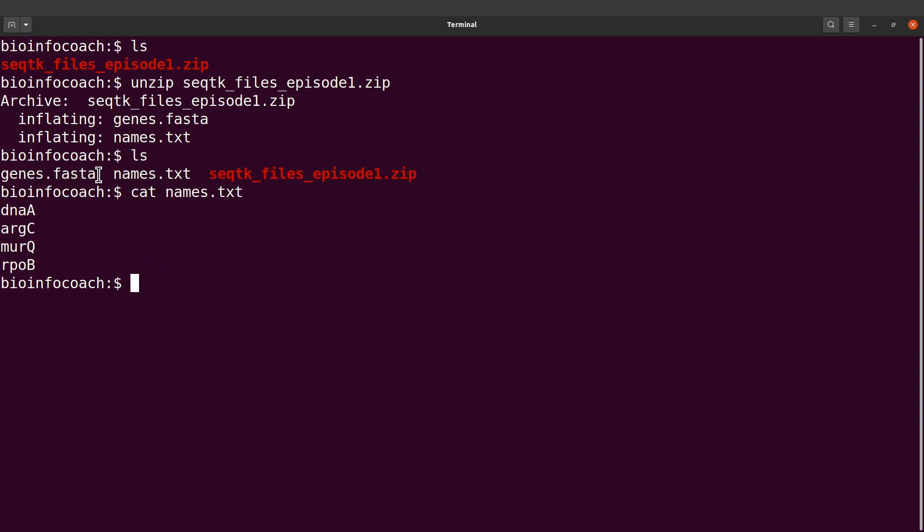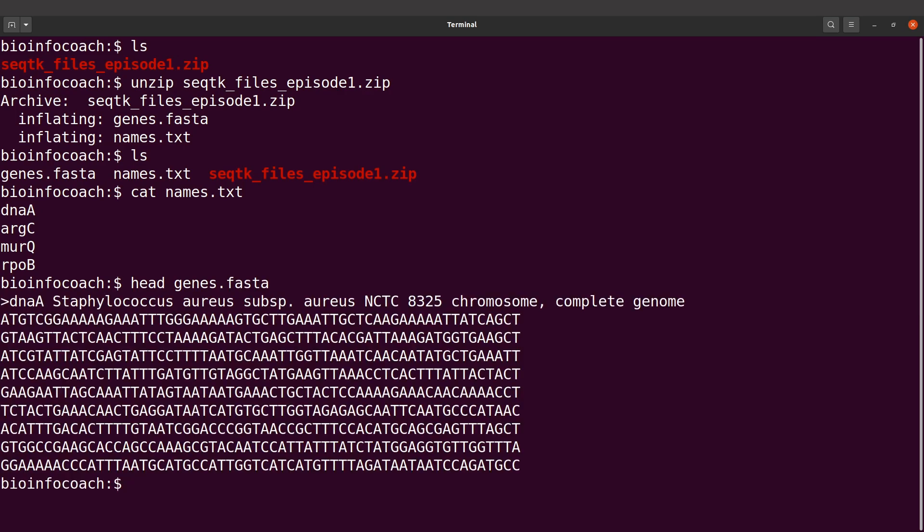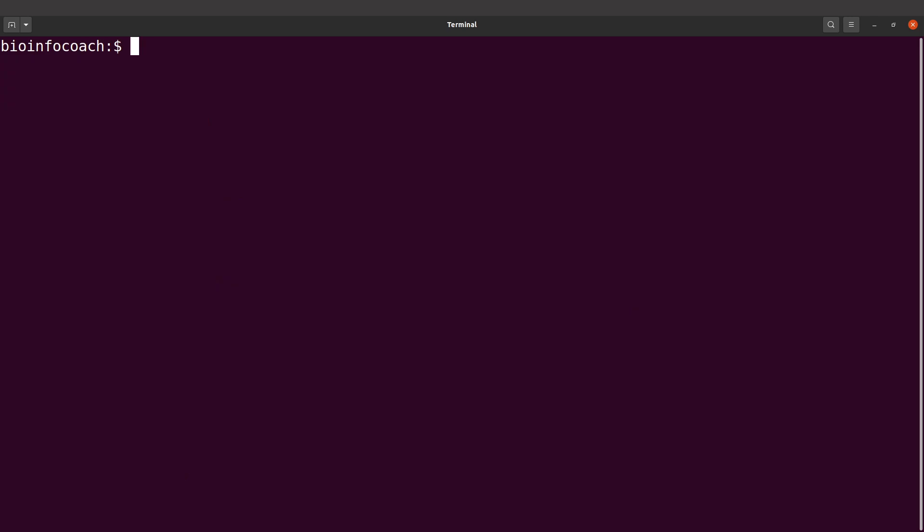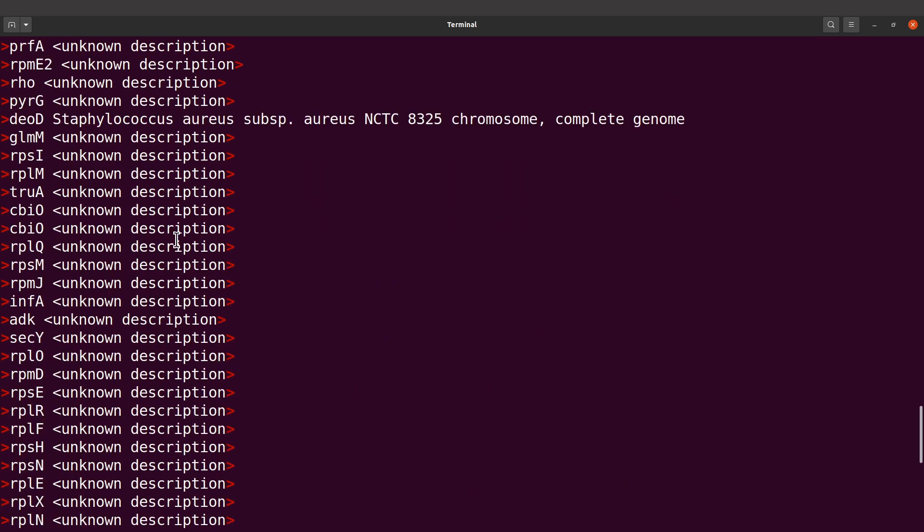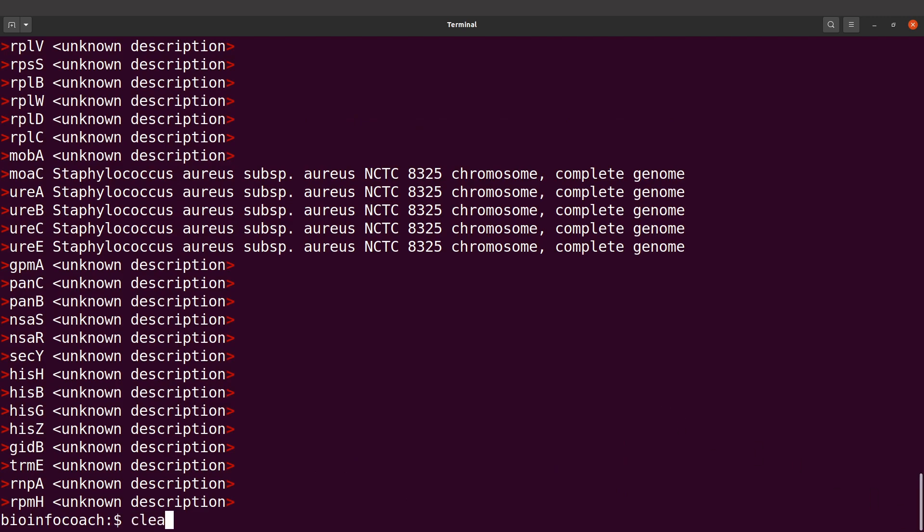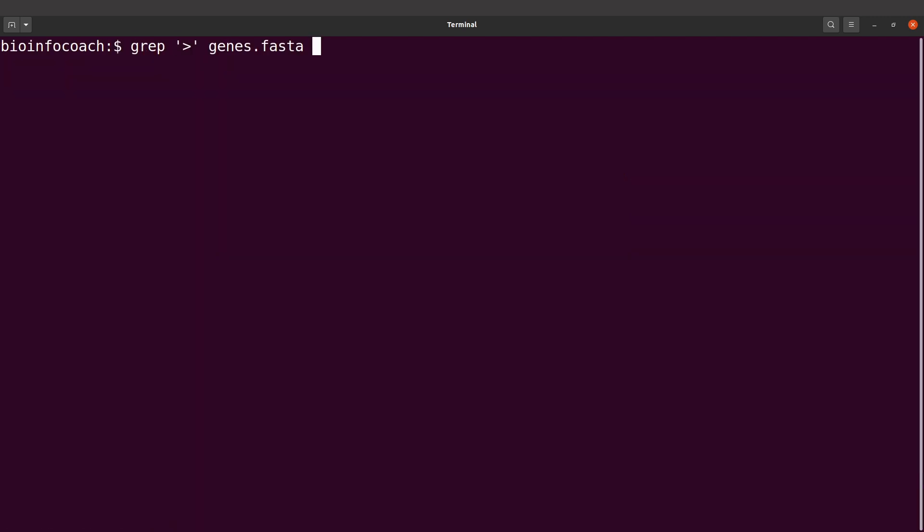This is the genes.fasta file which has lots of sequences. We can do head to display some. We just displayed some of the sequences. We can also display all the names. Basically, we have lots of sequences here. What we are interested in is those four sequences that I showed. That's what we are going to use seqtk for to extract the content.